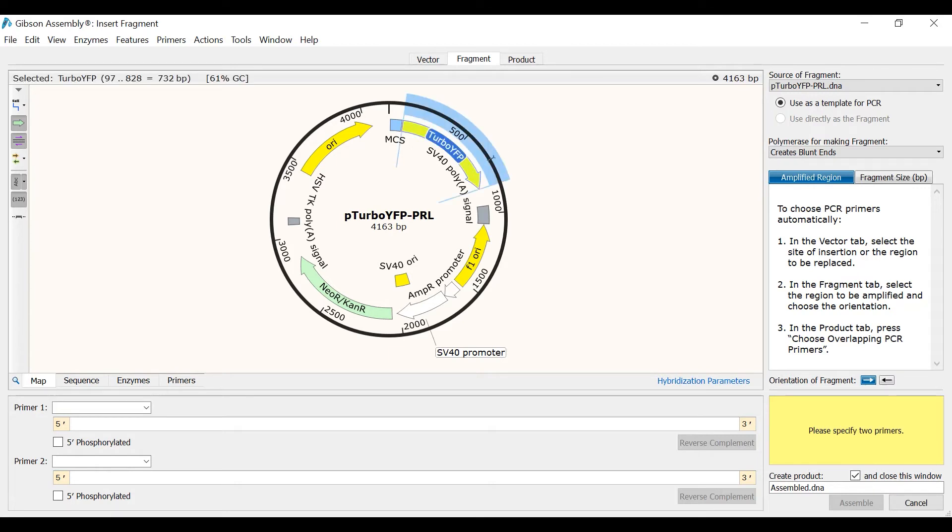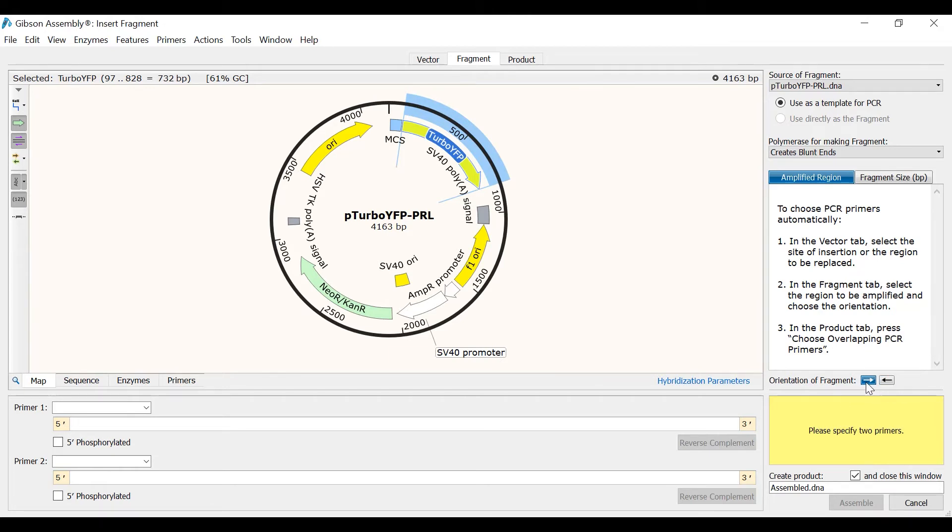Another important point to consider at this point is the orientation of the fragment. Fortunately the fragment I am inserting and the region I am replacing are in the same orientation. However if this wasn't the case, I can simply change the orientation of my fragment by using the arrows to the right.